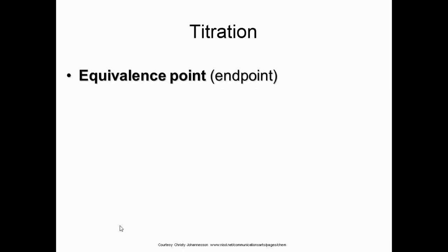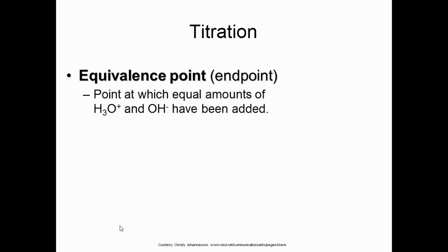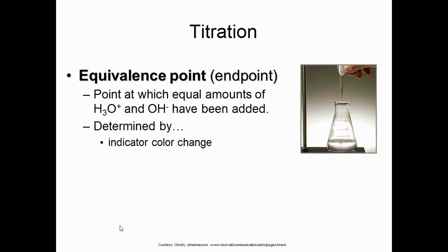How are we going to do that? Well, we're going to use what's called the equivalence point or the end point. The equivalence point is sort of a theoretical point, and we're going to define it as the point at which in solution, if you're doing an acid-base titration, you have equal amounts of hydronium ion and hydroxide ion in your solution. And how will we know when we reach that point? Well, that will be determined by a color change using an indicator.